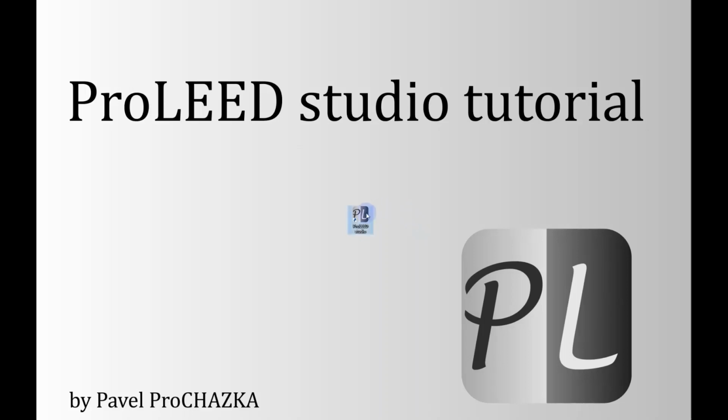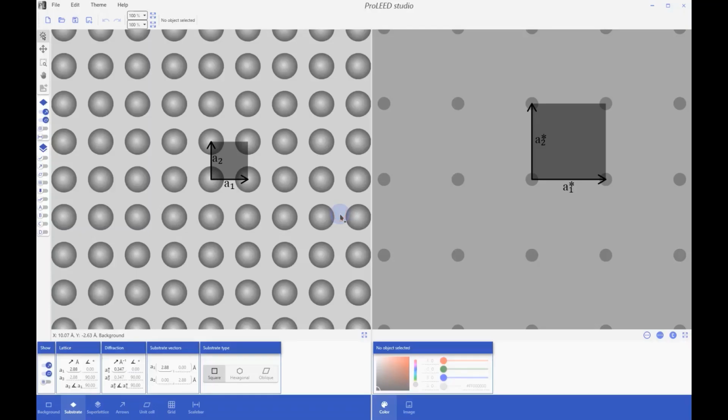When you run the ProLEED Studio software, the welcome window pops up and you can select the substrate type you want to use, or load your previous model by choosing the open button, or dragging your file into the welcome window area. In this tutorial, I will use the square substrate because at the end of this tutorial I will demonstrate all the modeling on the square substrate.